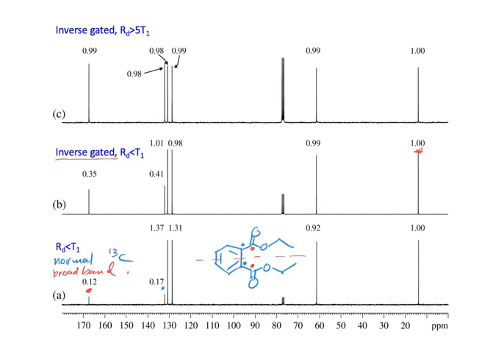But on the other hand, when we look at C13 spectra, oftentimes, because it's not run like that top spectrum, we can pick out quaternary carbons because they're the small ones. So we can use that information to our advantage as well. Always the quaternary carbons are small? Well, usually. Usually. Yeah.